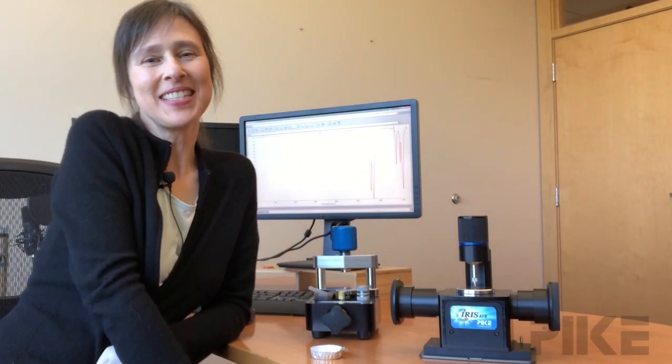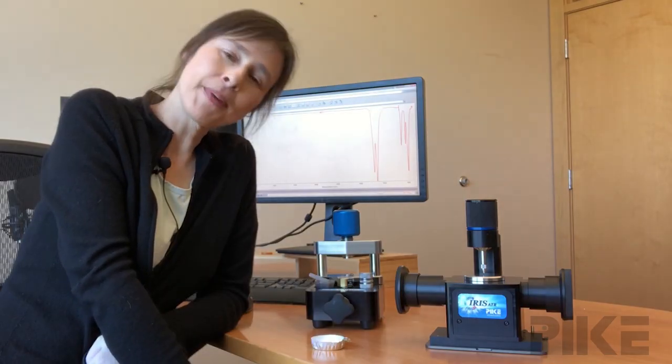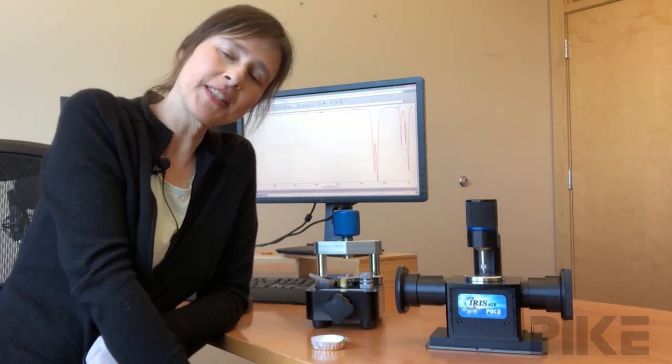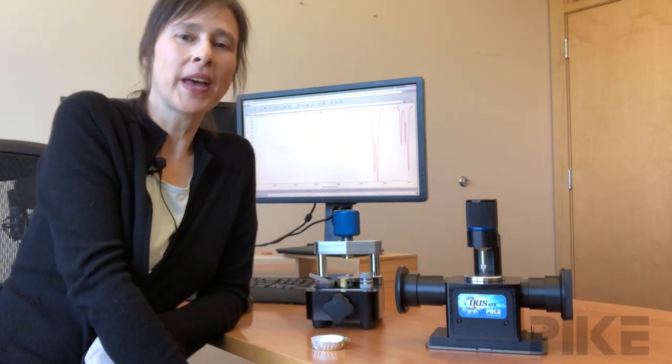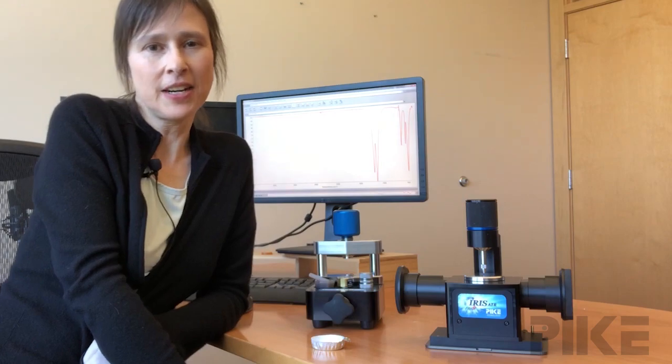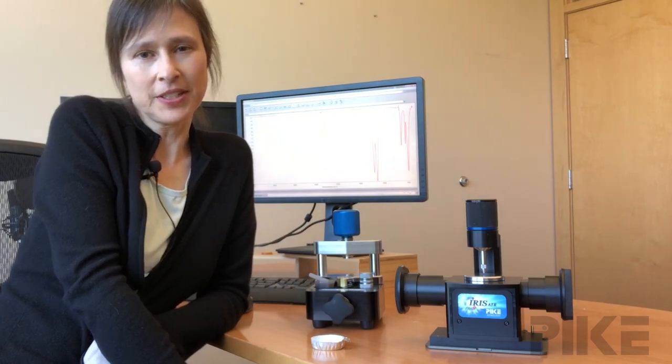Hello and welcome to the tip of the week. Today we're going to make a film out of a fluoropolymer and compare its transmission spectrum to that of an ATR of the raw material.